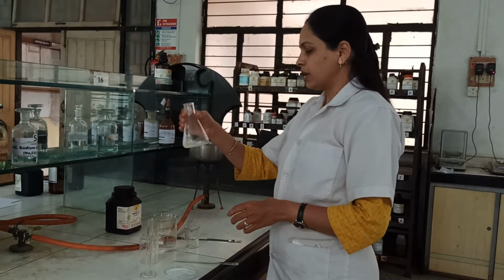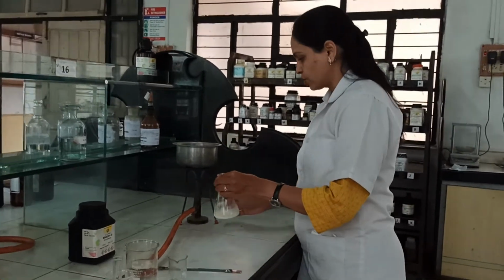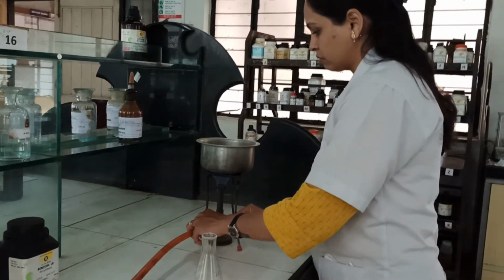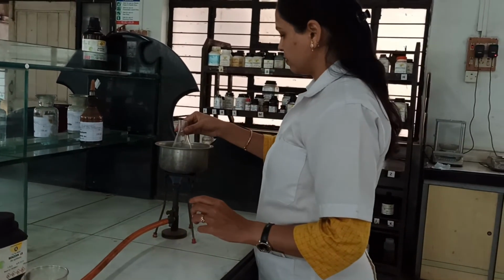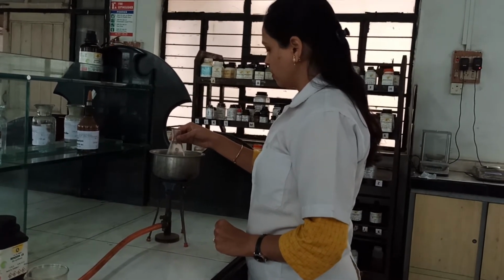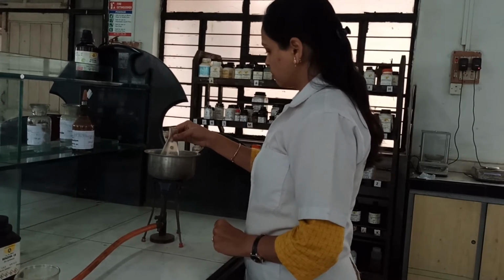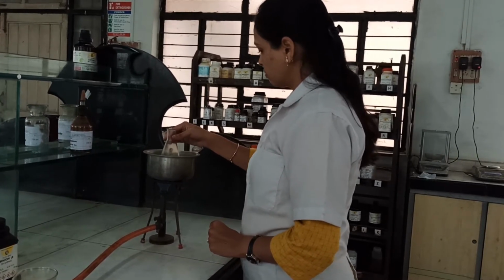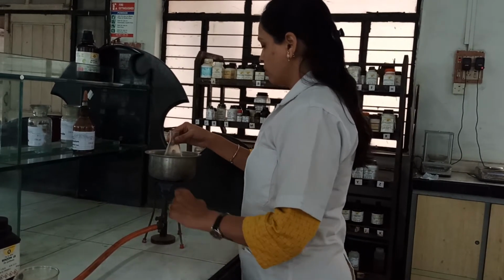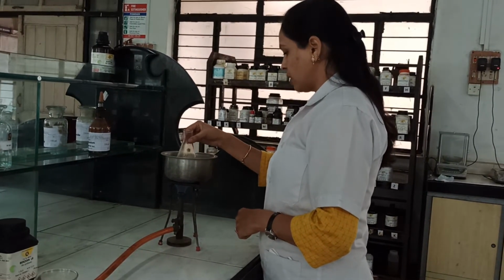After the addition of benzoin and concentrated nitric acid, we have to boil this solution on the water bath. You have to stir the content while boiling. You have to heat this content on the water bath for about 1 hour.